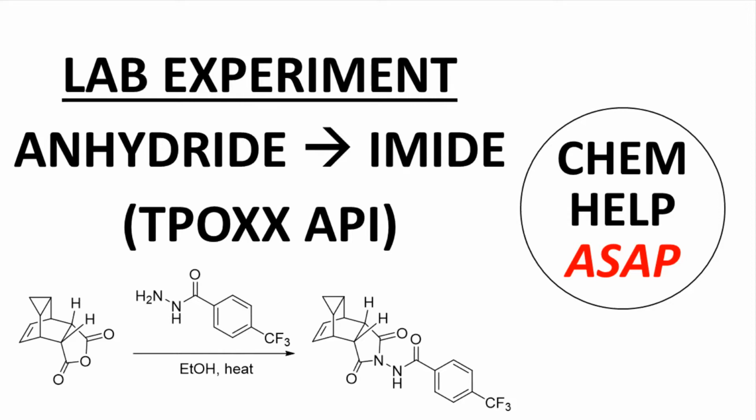An interesting aspect of this reaction is that the final product is the active ingredient for an approved drug called TPOXX, which is a treatment for smallpox infections. Handouts for the lab procedure and NMR spectra are available through links in the video description.